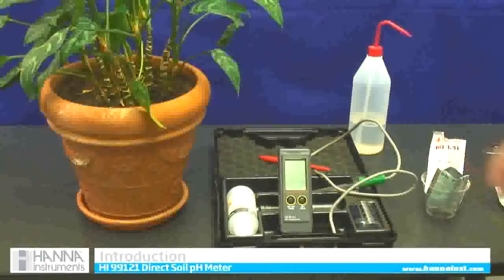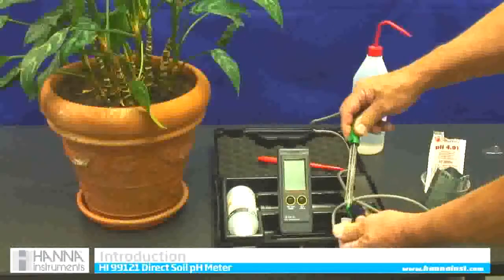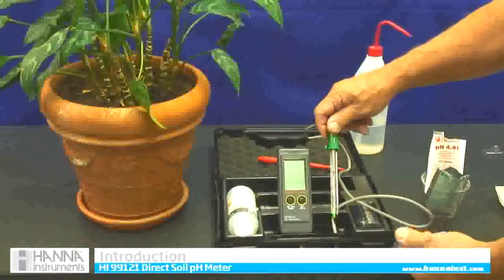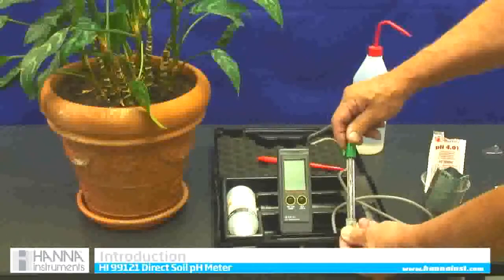It comes in a kit as we can see here. Here's our meter. It comes with a probe and the probe is glass. We make it out of glass on purpose so it is extremely accurate and fast responding, but you have to be careful — it is fragile. It has a nice glass probe.